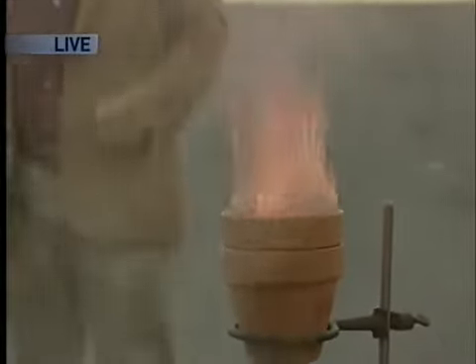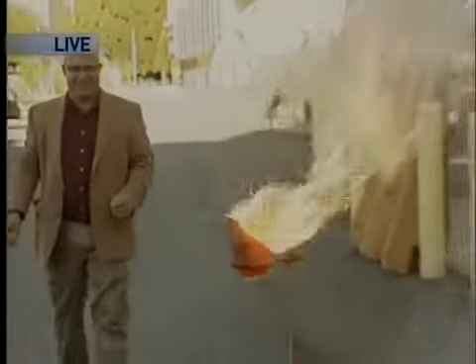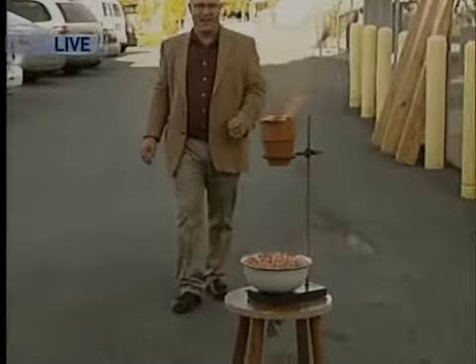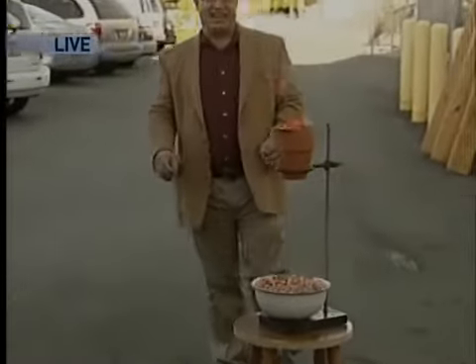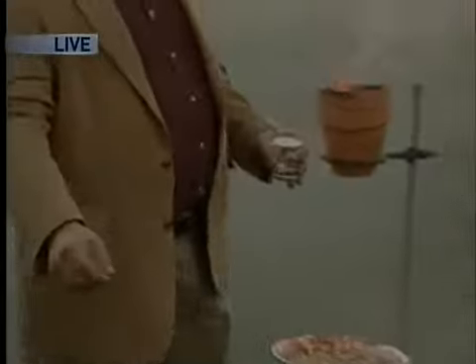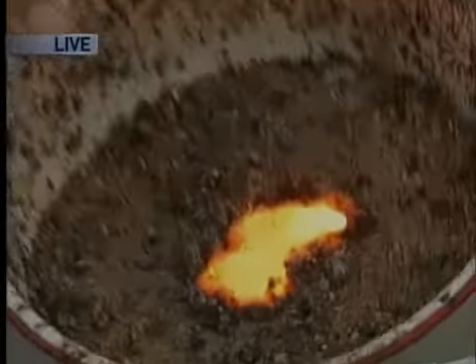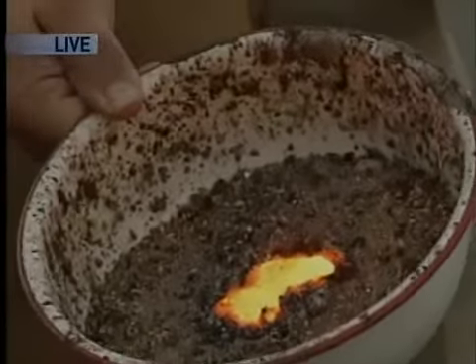Oh gosh, Jesse. Okay. All right, there's the smoke. So we're smoking a little bit, and the glycerin's taken off, and there's the thermite. Oh my gosh. All right. Cool. And if Al can get a close-up on this. That made molten iron that fast? You can see the molten iron here. Wow. Oh, cool. Yeah. So this is pretty nifty.